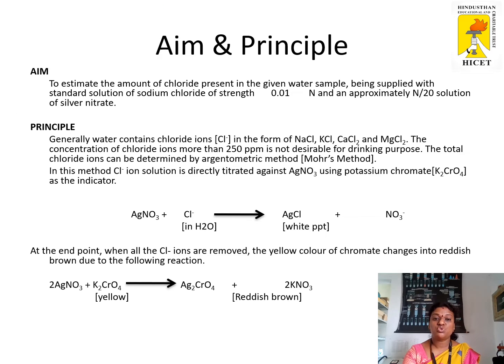So the aim is to estimate the amount of chloride present in the given water sample, being supplied with standard solution of sodium chloride of strength 0.01 N. Now I'm going to tell the principle of this experiment.